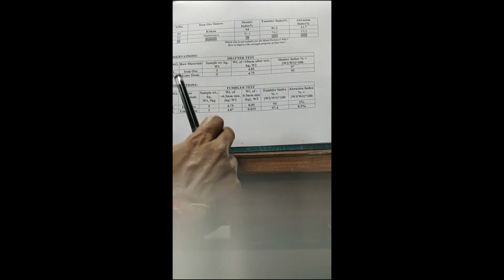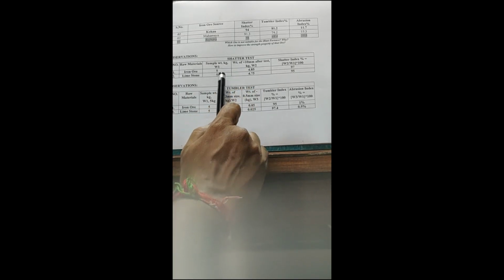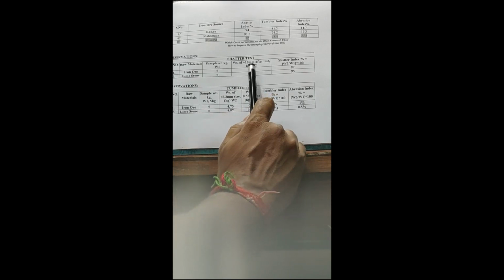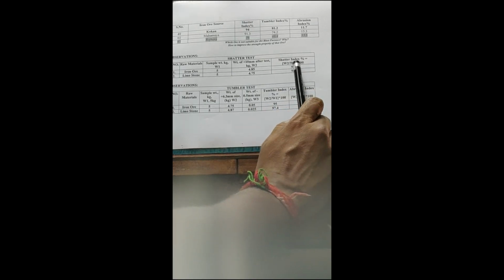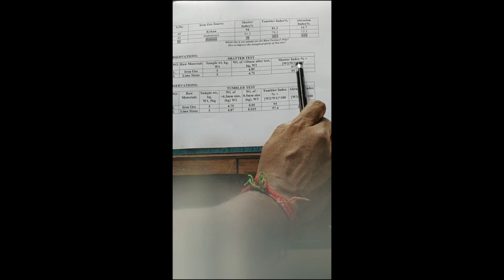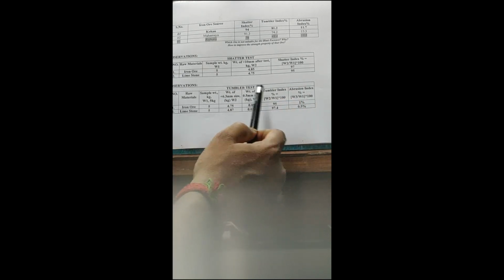Now the material tested in our laboratory, and the results. Here we can see the shatter test of iron ore and limestone. The initial weight taken is 5 kg each, and the weight fraction retained on plus 10 mm is 4.85 and 4.75. The shatter index we are getting is 97% for iron ore and 95% for limestone. In the tumbler test, we get two things, the tumbler index and the abrasion index.